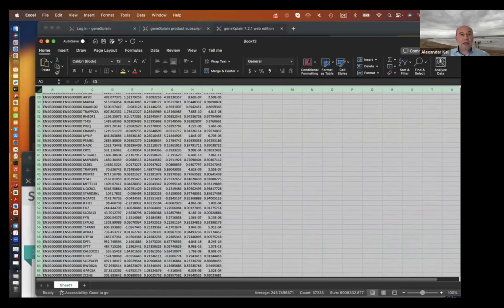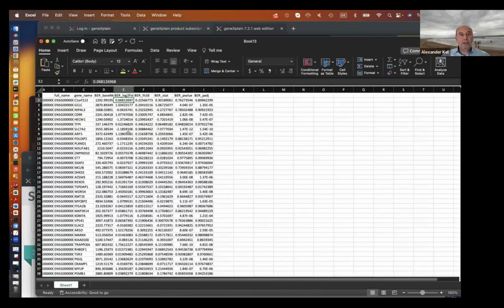So they calculated the log-fold change, the p-value, and the adjusted p-value. These are genes which have a significant p-value, though not all are significant, so we can upload this set of data first, and then we can filter it. That's all gene expression data, but we still have to filter which of them are up-regulated and which are down-regulated. All right, so we have this file.